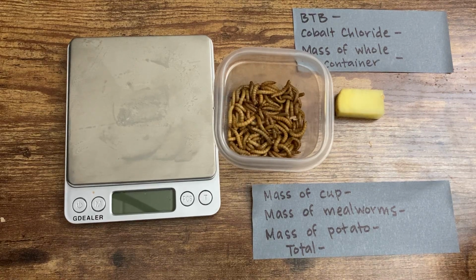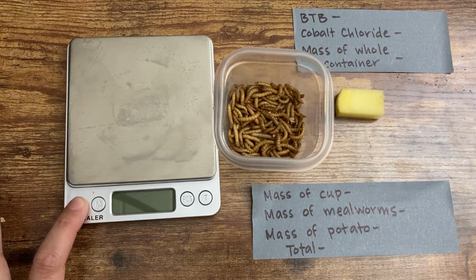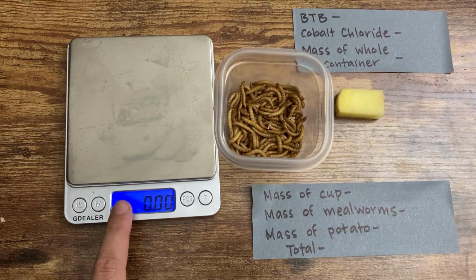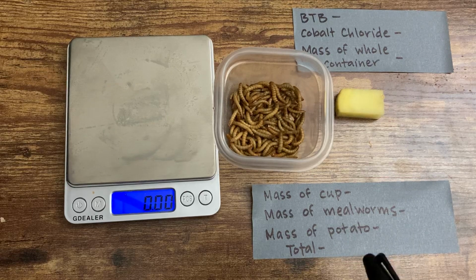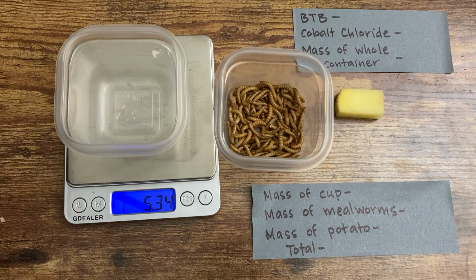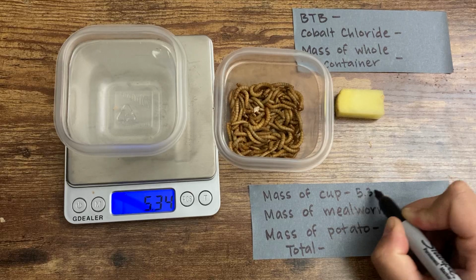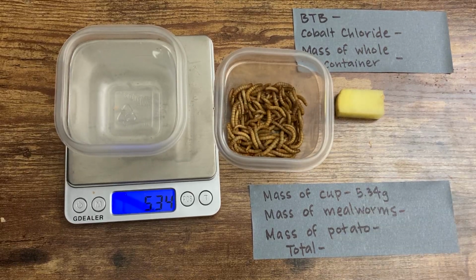All right, everyone. Today we are doing this setup for our mealworm eating lab. So the first thing I'm going to do is turn on this balance and make sure that it is set to grams, which you can see here with a little G. And I need to find the mass of the cup that I'm going to have the mealworms in. So put the cup on the balance. The total mass of the cup, I am recording it, you should record it too, is 5.34 grams.